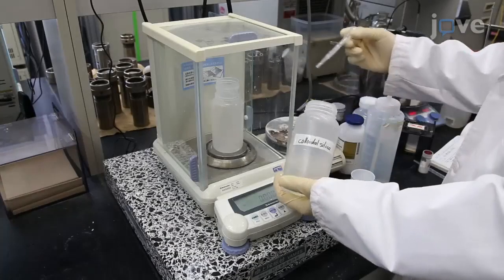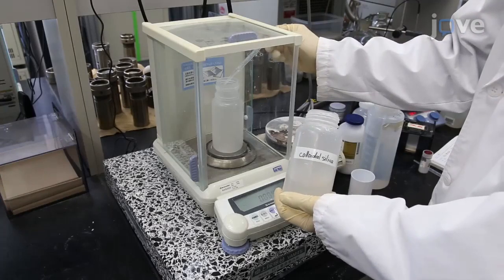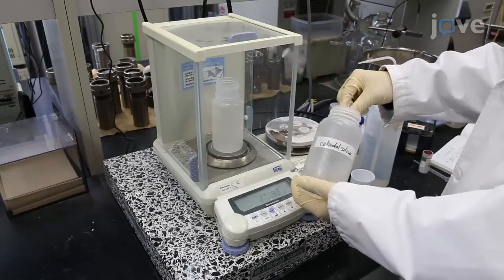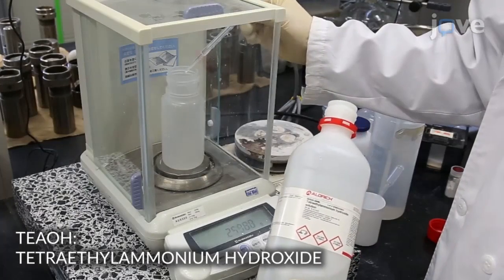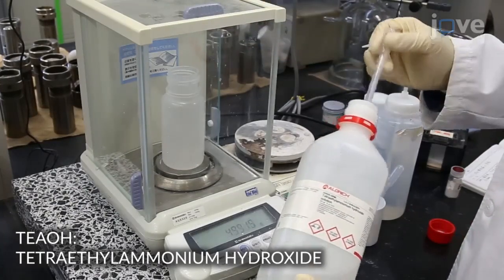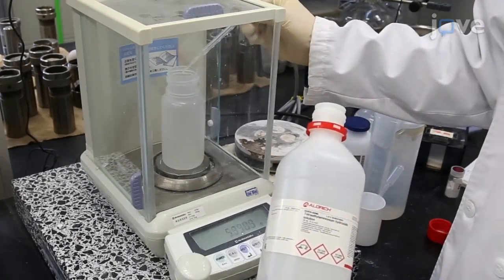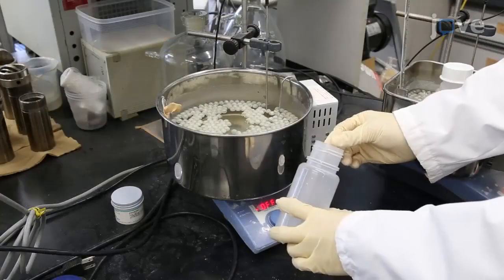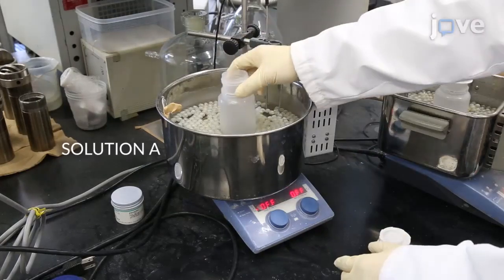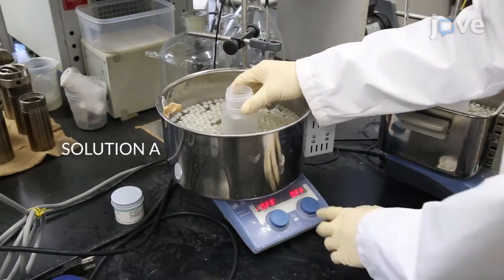First, add 26.2 grams of colloidal silica and 8.39 grams of tetraethyl ammonium hydroxide into a 250 milliliter bottle made of polypropylene. Stir the mixture using a magnetic stirrer for 20 minutes in a 50 degrees Celsius water bath.